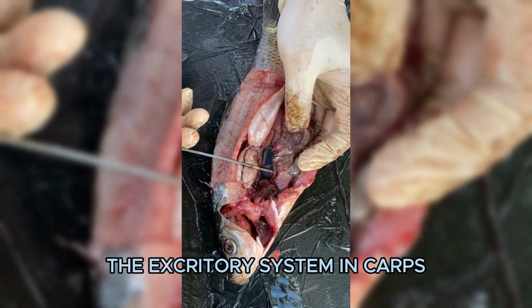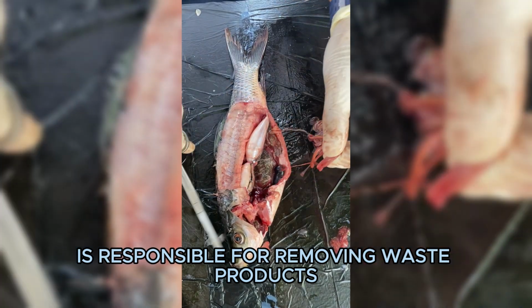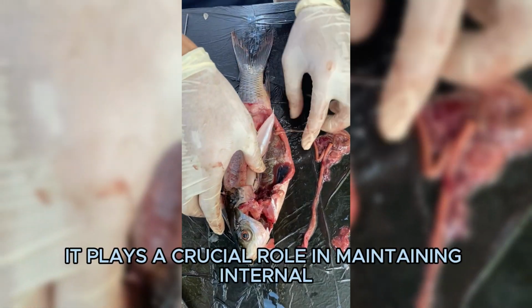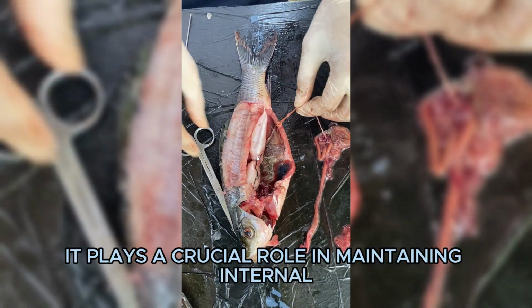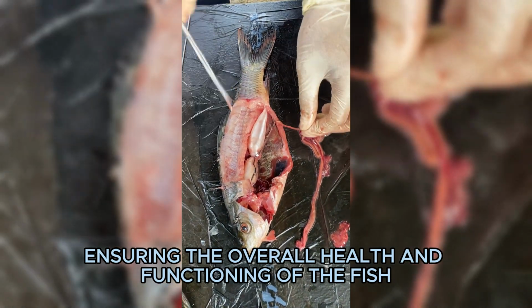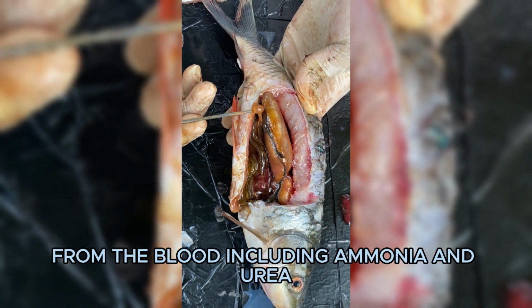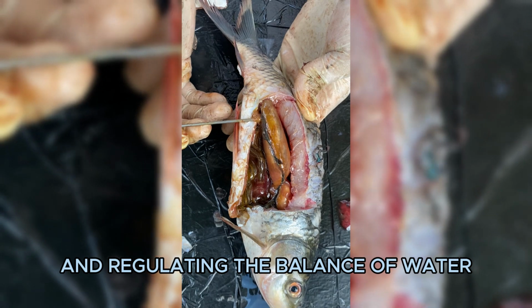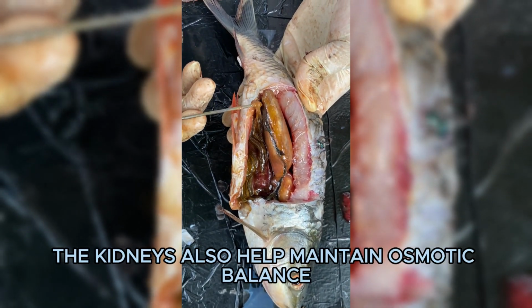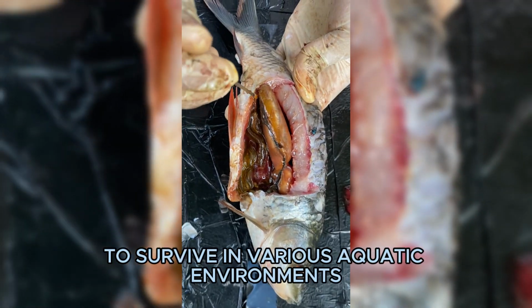The excretory system in carps, like in most vertebrates, is responsible for removing waste products and regulating water and electrolyte balance in the body. It plays a crucial role in maintaining internal homeostasis and ensuring the overall health and functioning of the fish. The kidneys are responsible for filtering waste products from the blood, including ammonia and urea, and regulating the balance of water and electrolytes in the body. The kidneys also help maintain osmotic balance, which is crucial for the fish to survive in various aquatic environments.